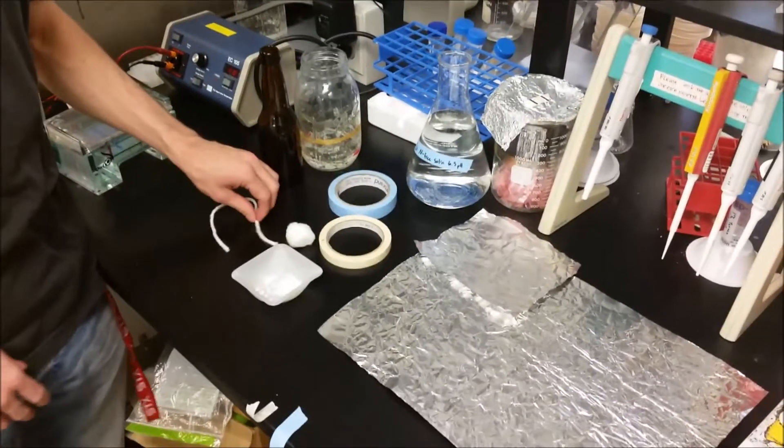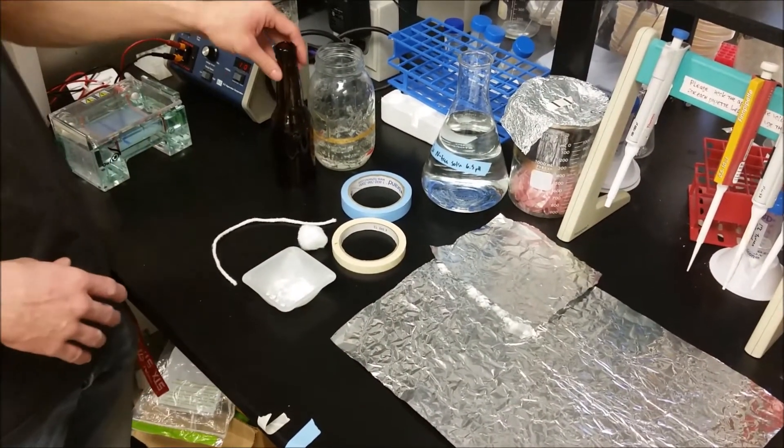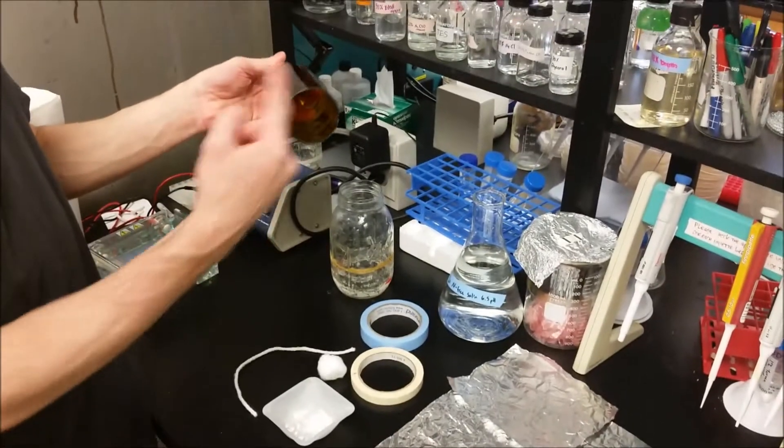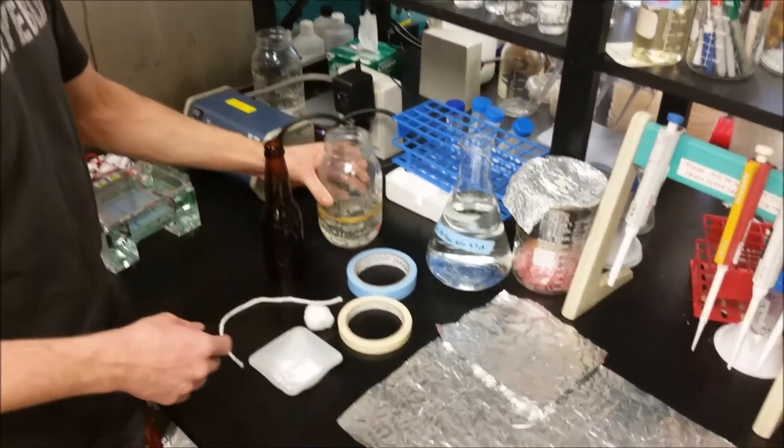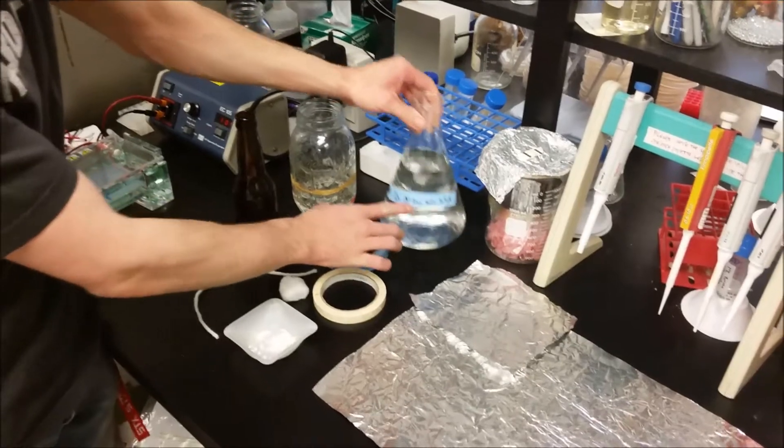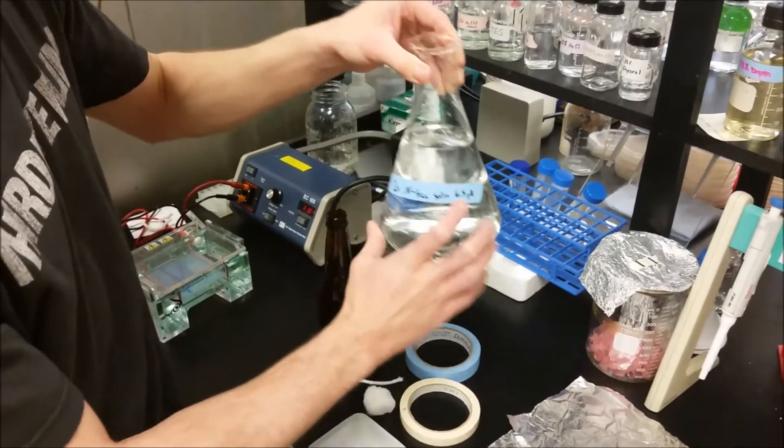Hey guys, so today we're making a Leonard jar. Basically what we have together right now is all our ingredients. We have a beer bottle that is missing the bottom, a mason jar, our one times nitrogen free watering solution pH to 6.5.